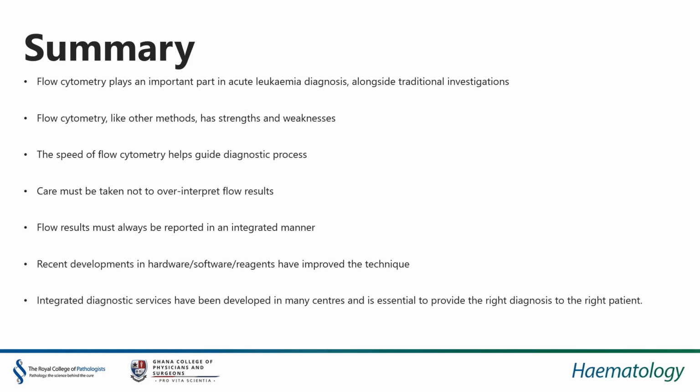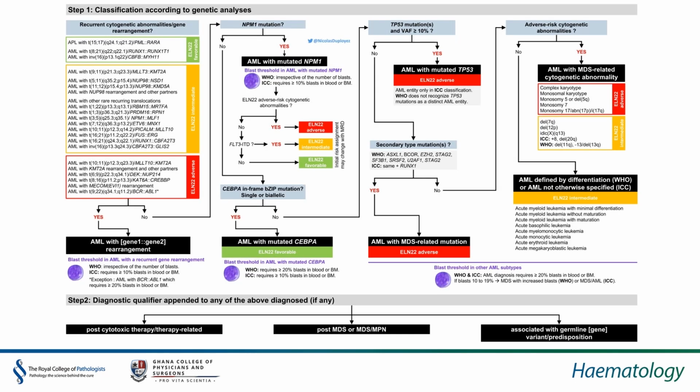Now, this was taken off of Twitter. This is just a diagnostic algorithm, which you can pause on this slide, which is quite nice, which basically looks at some of the newer classifications, the 5th edition of the WHO and the ICC classifications, looking at AML classification according to genetic analysis.